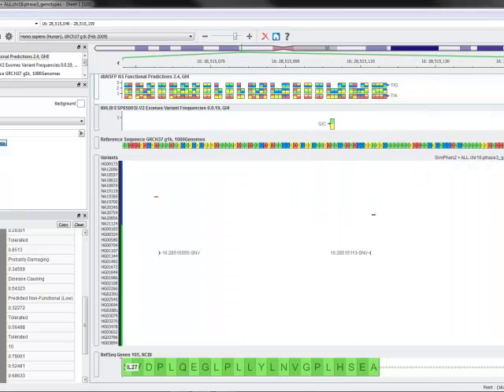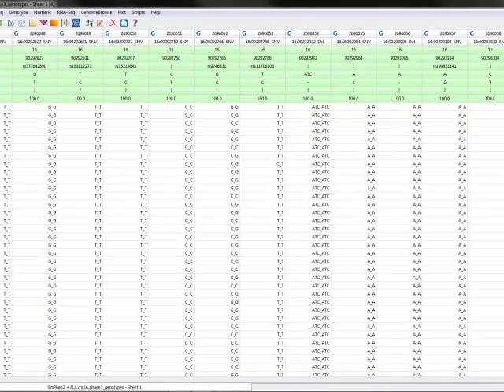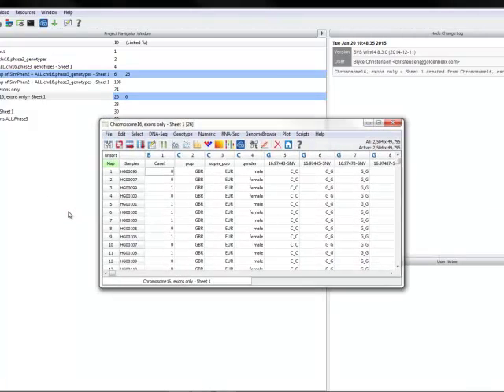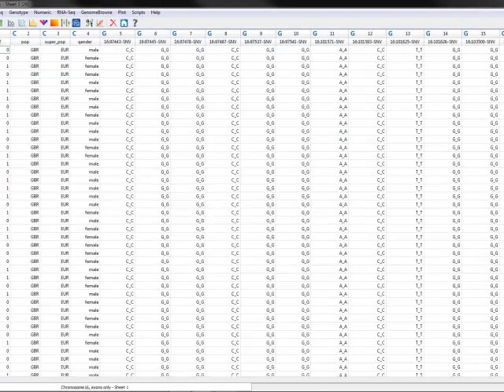So what I'd like to do is back out of this and open a different spreadsheet. This is one that was filtered in advance only to show the exon regions of chromosome 16. You'll notice that the data is much smaller now. Only 50,000 out of the 2.7 million variant sites on the chromosome occur within exons. But if I want to do a rare variant test on this type of data, I would start by identifying the profile of variants I want to keep.